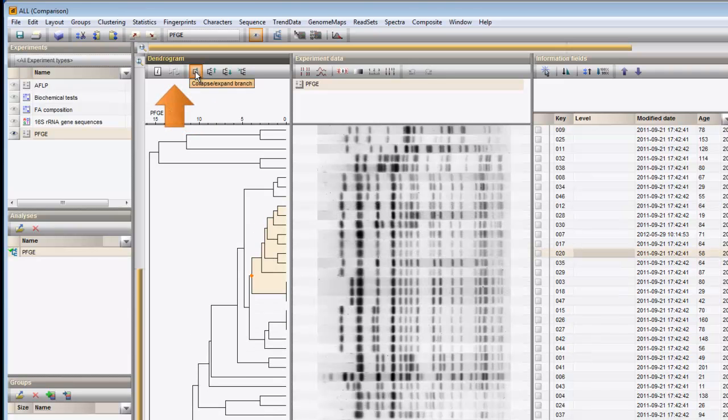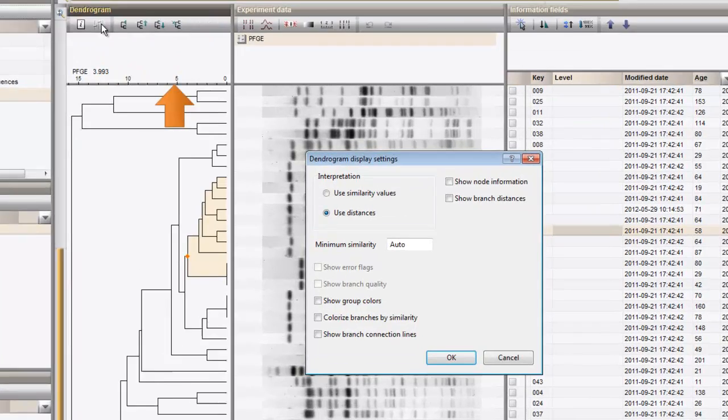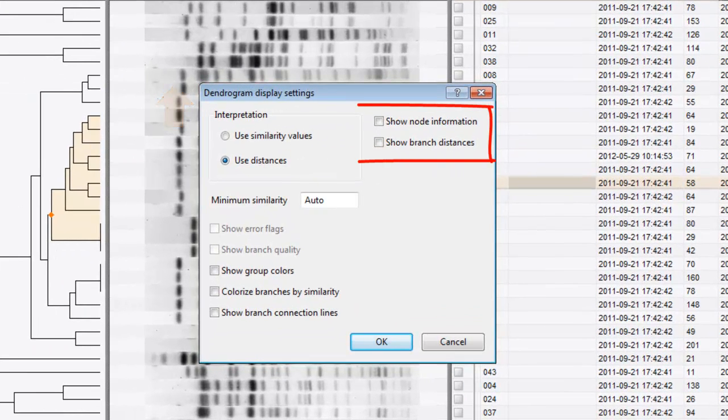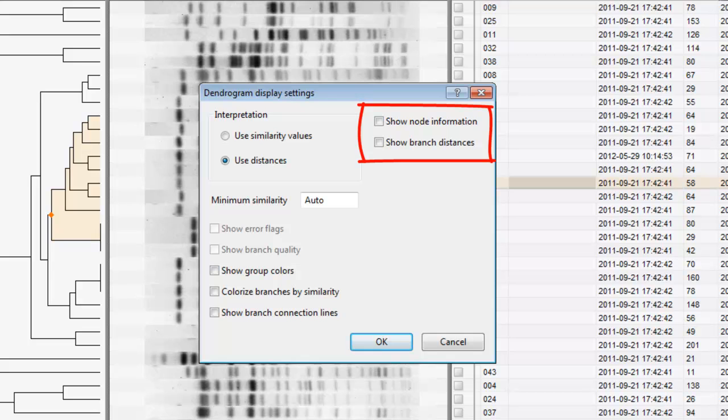For more dendrogram options, I can call the display settings. Here I can show the distances from the nodes to the tips, and or the length of the branches. As an example, I will display the node distances.